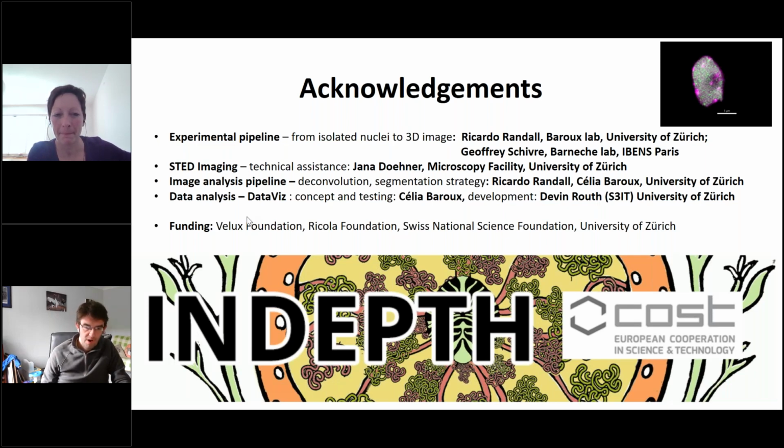Okay, a question from Ulkar, and he asks, he's got some mutant lines which have a dispersed chromocenter. He's wondering if it's possible, via the spot segmentation, to visualize the structure, but without super resolution microscopy.